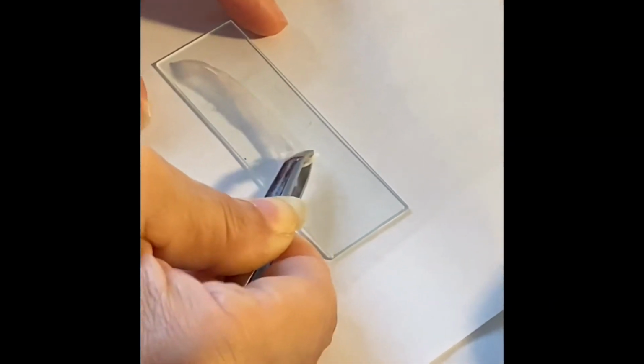You need to make sure it's flat and not folded over. Right there in the middle is a flattened portion.